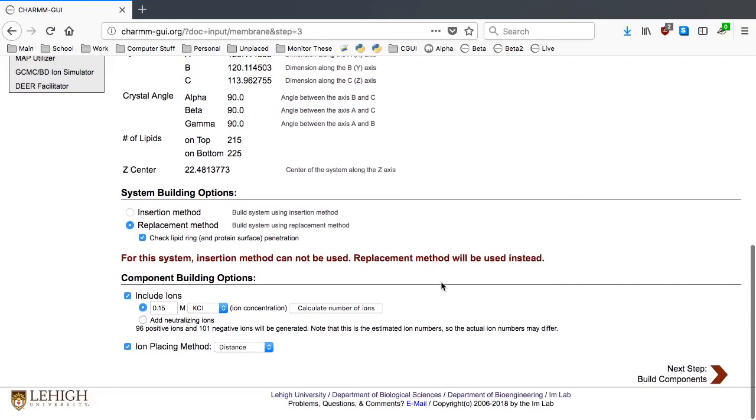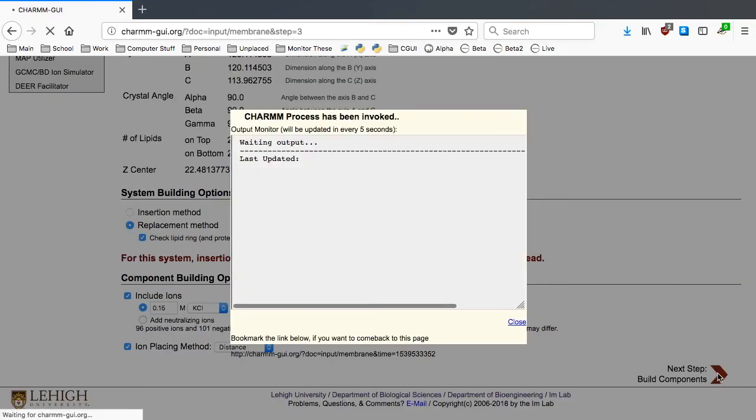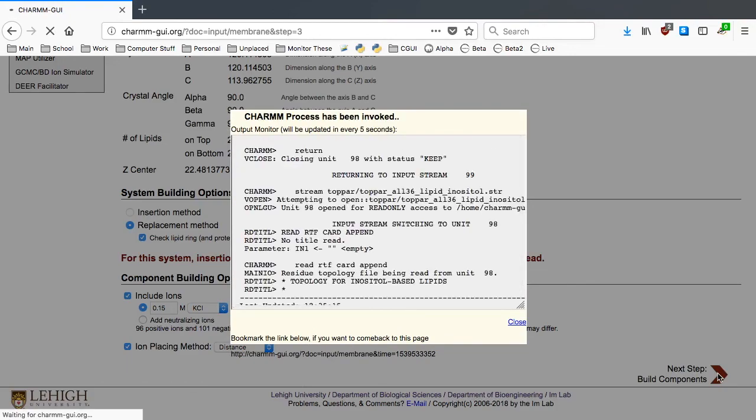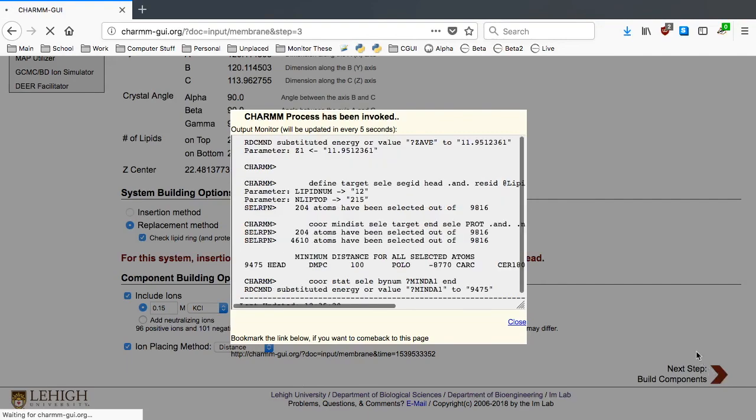Now, assuming that the default options for ions are reasonable, we can click Next Step to build a DMPC bilayer. The pseudospheres are replaced by real DMPC molecules in this step to avoid any bad contacts in the system. This is the most time consuming step in Membrane Builder.